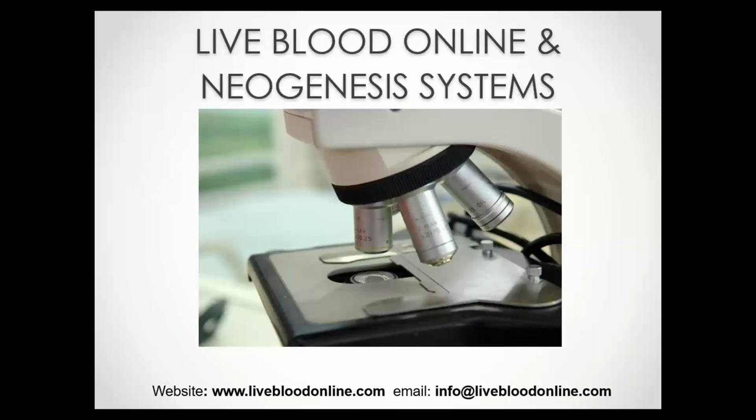Now, specifically, there is a long list of imbalances and indicators that can be detected, such as oxidative stress, toxicity, stress, and the functional health of various specific organs, acidity, various deficiencies, many interesting microbial indicators, degenerative patterns, and much more. Thank you. So what does the test procedure involve and how long does it take?